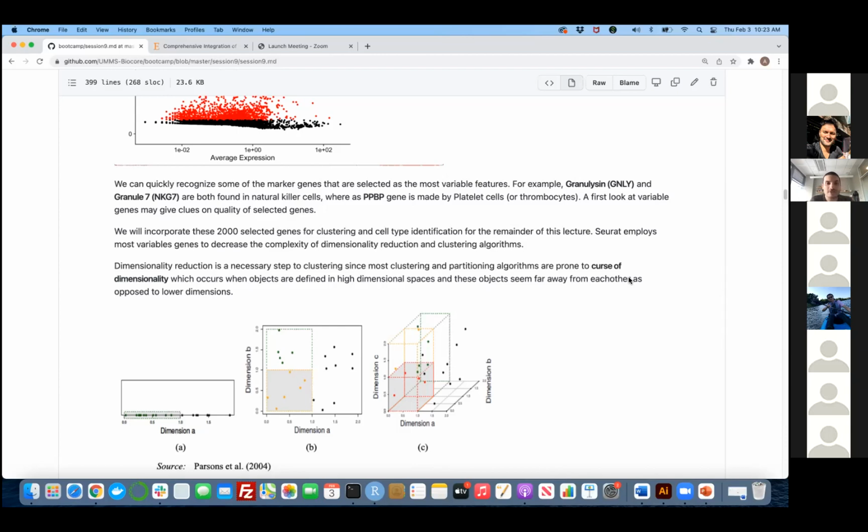So what we're trying to see is if there are some correlated genes among these 2000 selected ones, we're trying to come up with a lower number of some kind of genes. They're not going to be actual genes, but we're trying to find some lower dimensional space that will still represent the information that we have from 2000 genes, but we wouldn't have 2000 dimensions to start with.